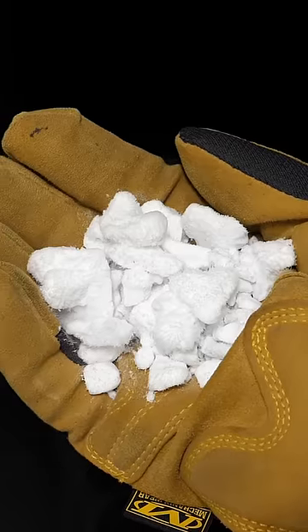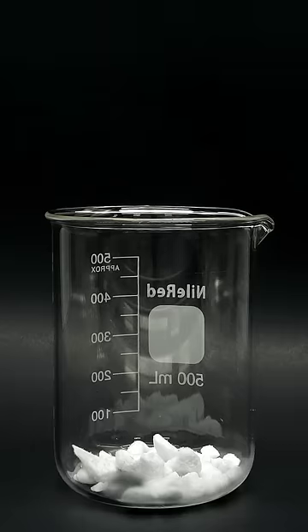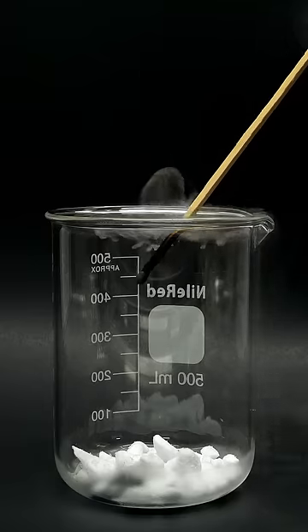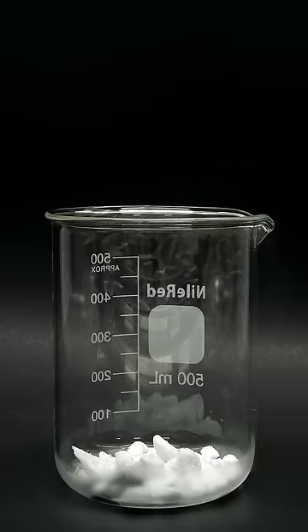What I have here is a bunch of dry ice, and I'm just going to drop it into a beaker and wait a bit. Now, if I light a match and try to put it in, it almost instantly goes out. This is because, as the dry ice sublimated, it pushed out all the air and filled the beaker with CO2 gas.